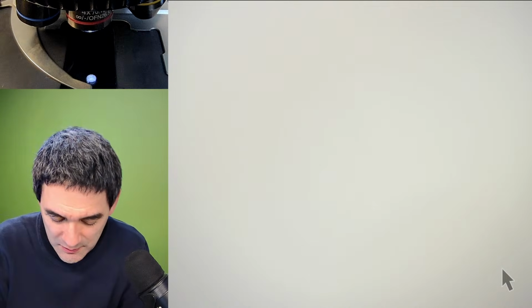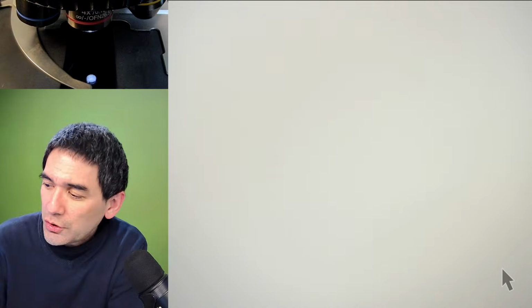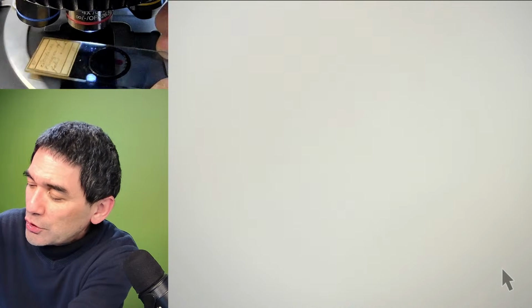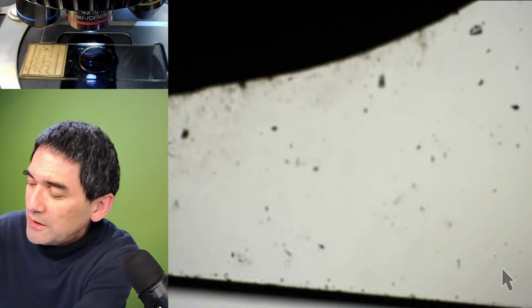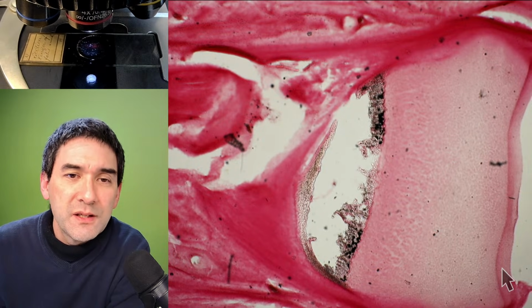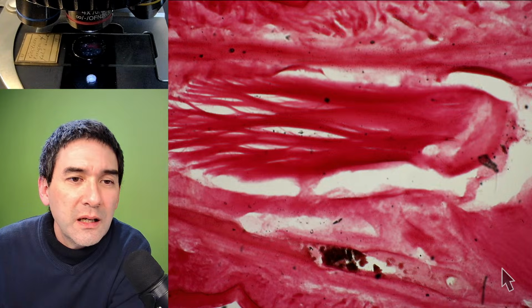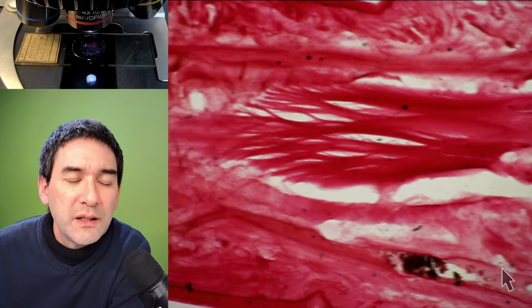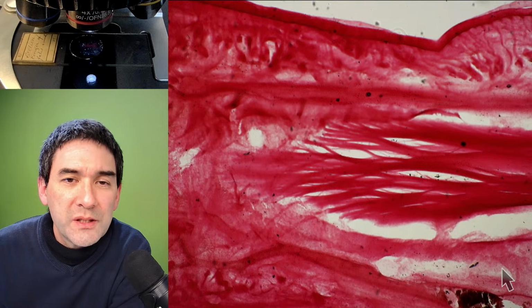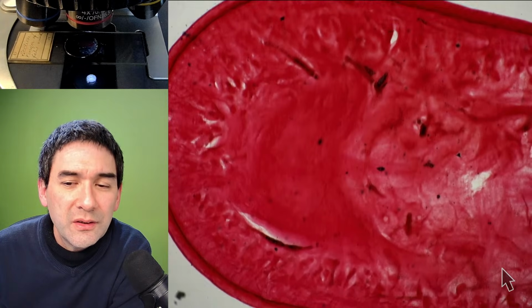And the other one that I have over here is the less interesting, I would say. You don't see quite as much, but it's slightly more controversial. It's human tissue, the finger of a baby, of a fetus. This one over here is the fingernail. And here again, if you look at it, you see a whole bunch of muscle fibers and tendons and so on, and the skin on the outside here.